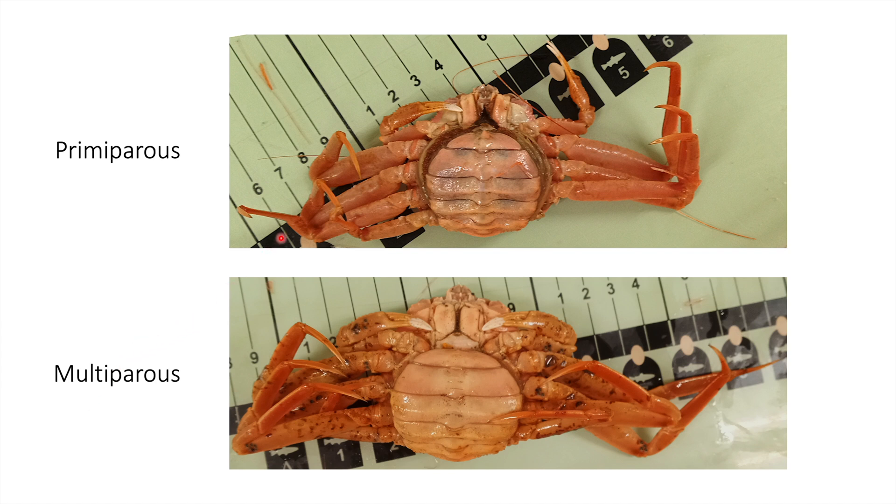Females with very clean shells are considered primipyrus, such as the individual in this top image here. Females with shells starting to become dull, with the claws no longer iridescent and with increased fouling, are considered multipyrus, as shown in this bottom image here.